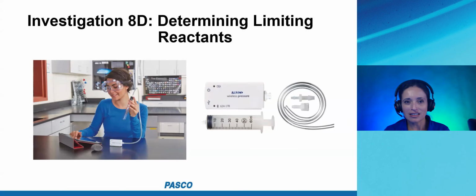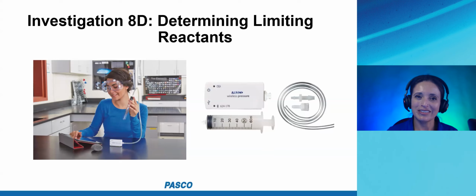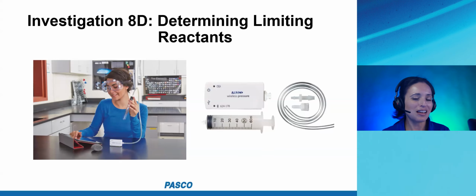Okay, I had mentioned before I started recording, if you want to participate in this thing called shared sessions, get SPARKvue and I'll cue you when it's time. Well, now it's time. So if you're watching live, you'll be able to participate in this if you want. If you are interested in seeing this live data that I'm collecting here at PASCO on your own device, I recommend getting a second device, not the one that you're watching on right now.